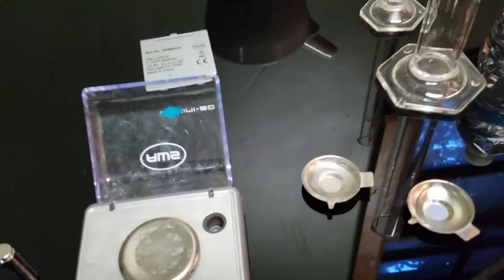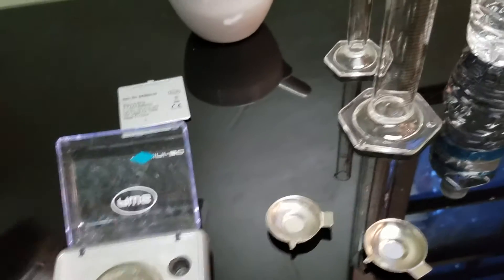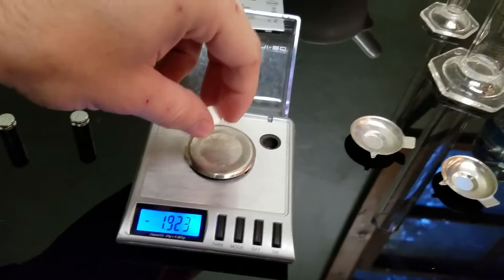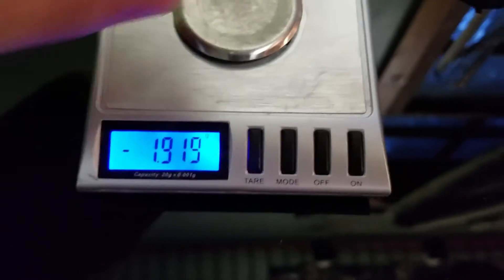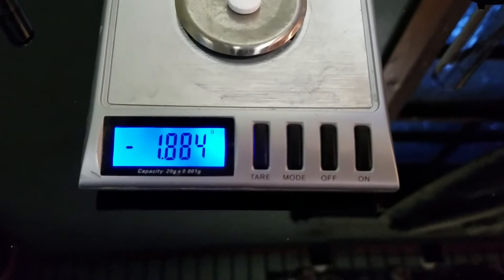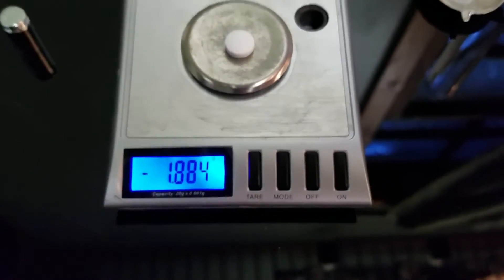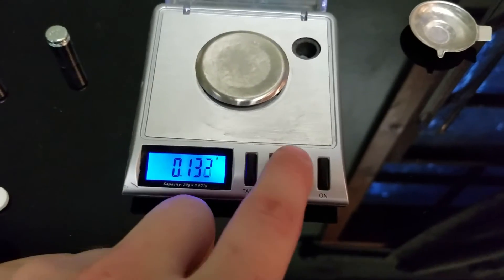We're reading zero grams. I have my aspirin pill here. It's already changing its weight. It's staying consistent, which is better than usual — sometimes it goes up and down. But as we can see, it's reading negative.